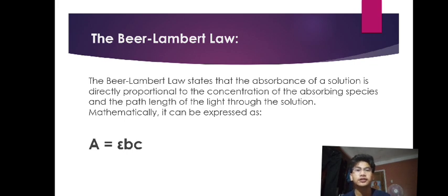Okay, since you already understand the first part of our lesson, let us now proceed to the quantitative application of UV visible spectrometry, which is the Beer-Lambert law.